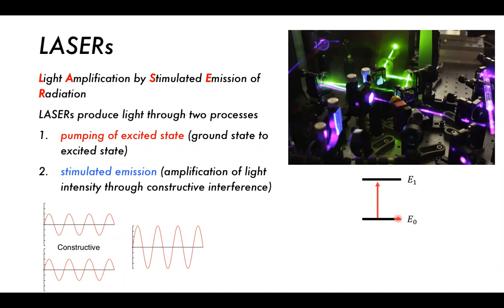It's not really used that much in absorption measurements, because absorption measurements typically make use of continuum sources, but it is a form of light generation, which is important in things like infrared spectroscopy.